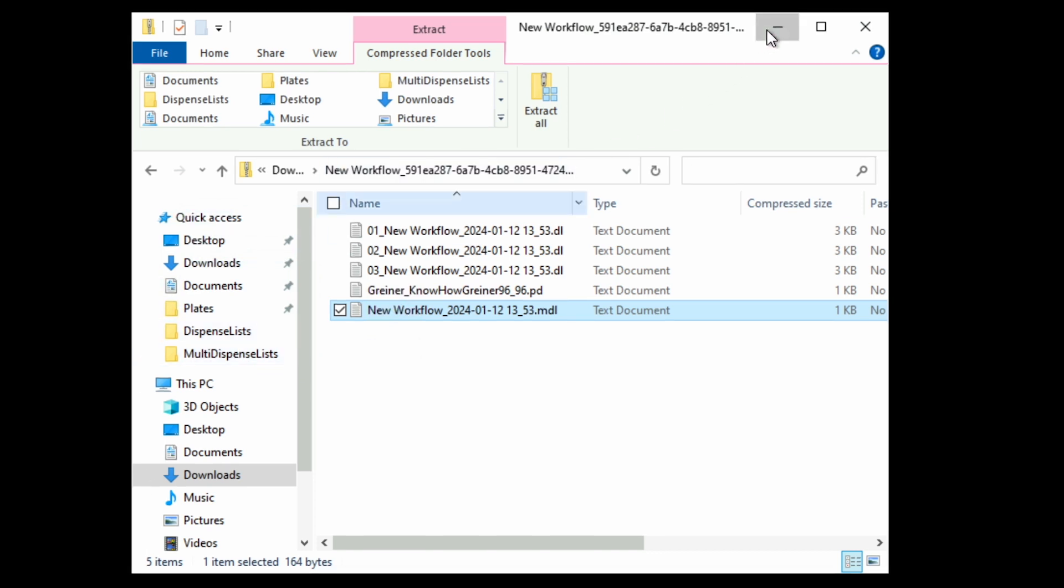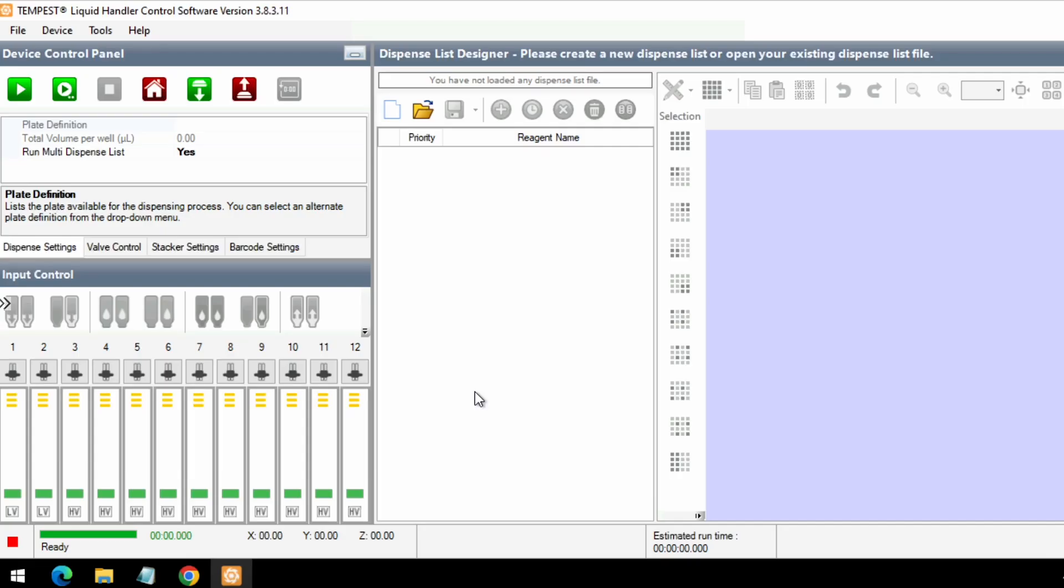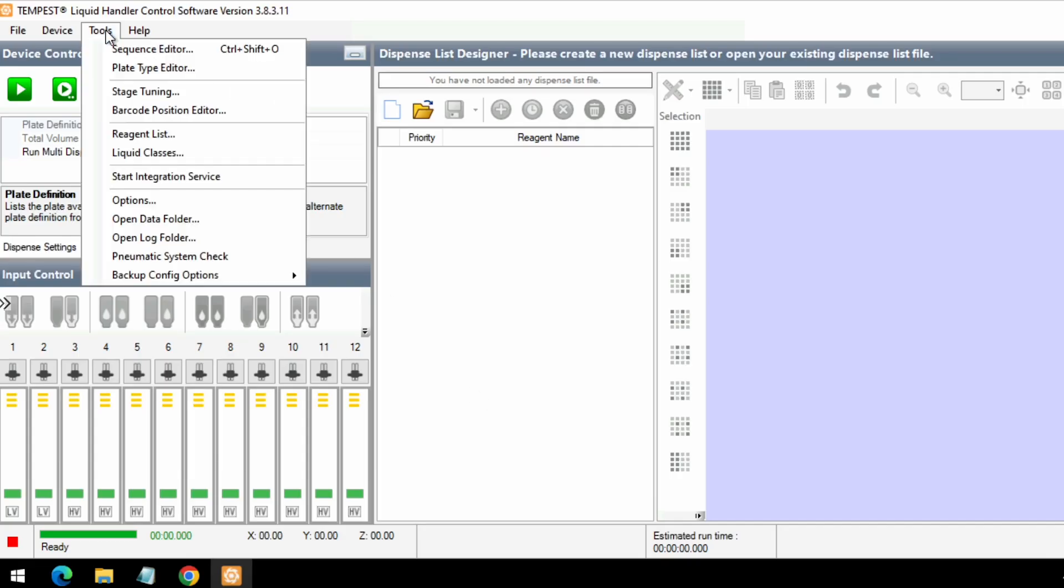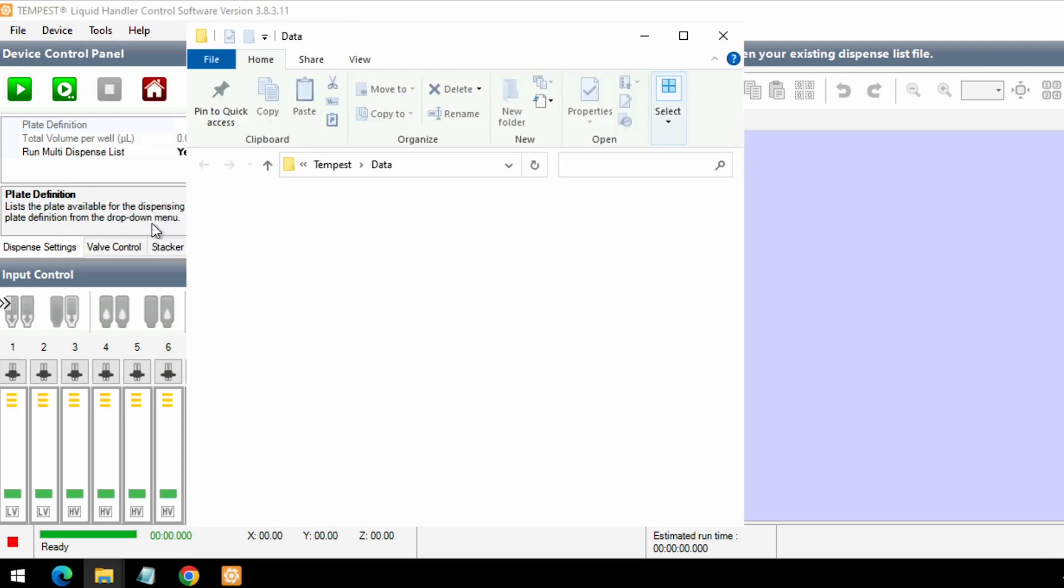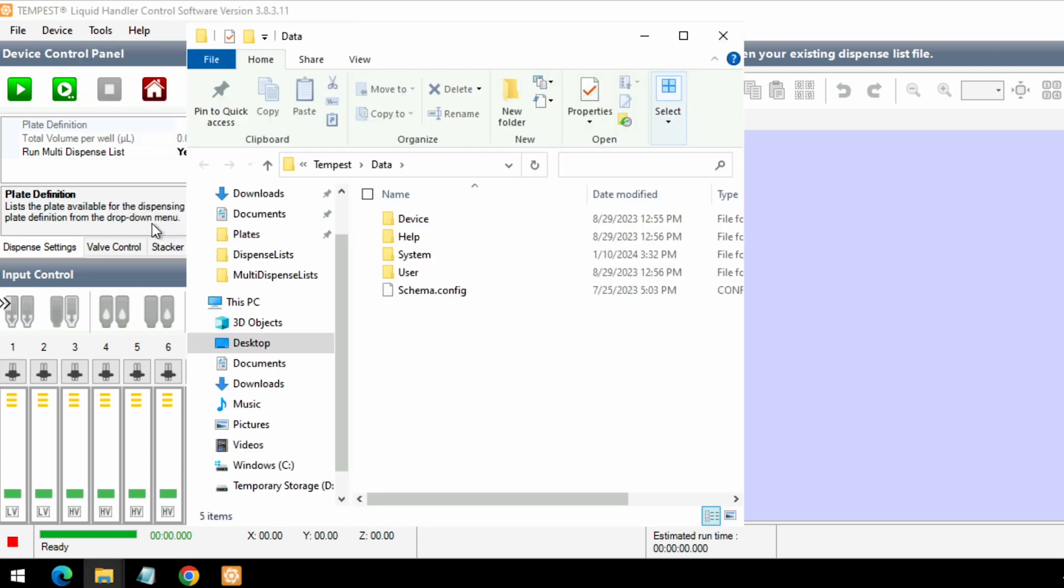If you're struggling to find the correct folder for each file type, you can simply open up the Tempest software, go to Tools, Open Data Folder, and you'll be directed to the correct folder.